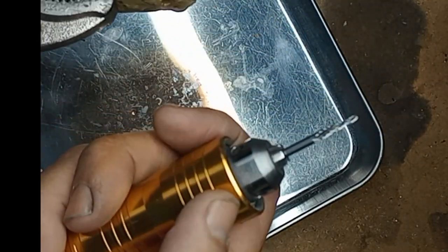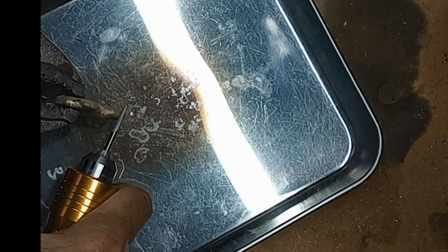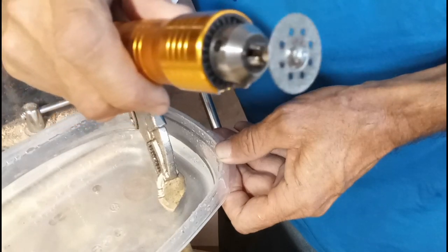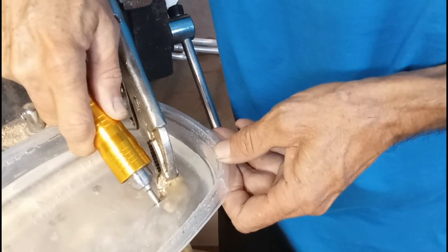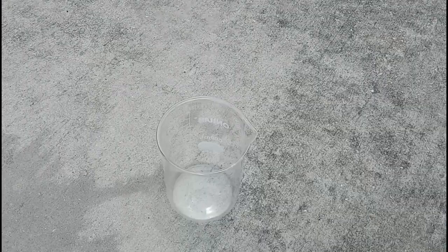Separating the brass mechanically first would make it a lot easier to dissolve in acid. I tried a file — really slow — then a rotary tool with a tungsten carbide bit, which was really messy. I tried a hacksaw, which cut okay but started dulling the blade. Then I tried a rotary tool with a diamond cutter bit in a bath of water. That made a lot of cuts and I was saving the dust, but water got everywhere and eventually all the diamonds wore off the cutting edge.